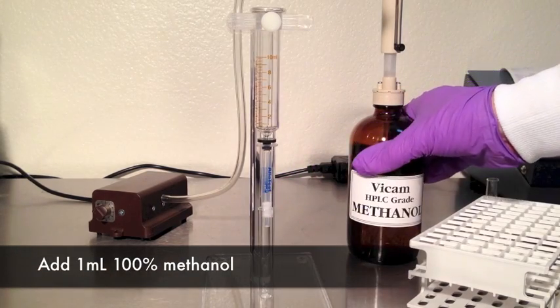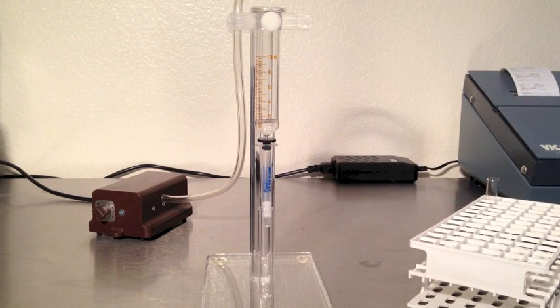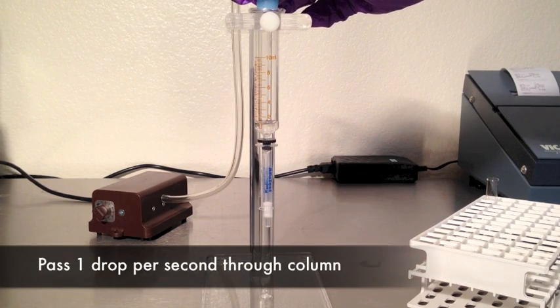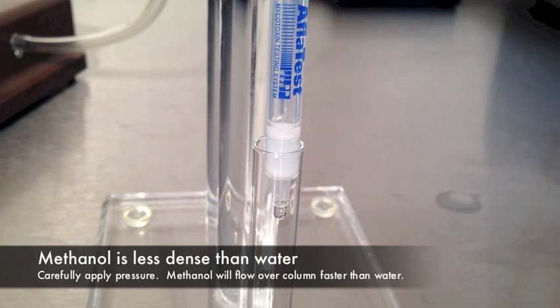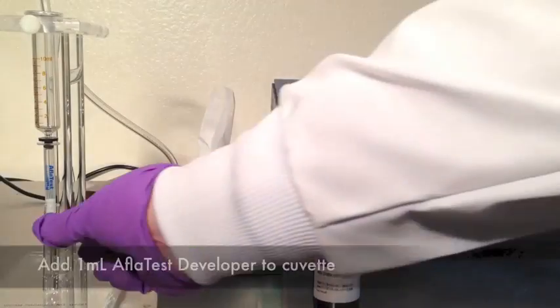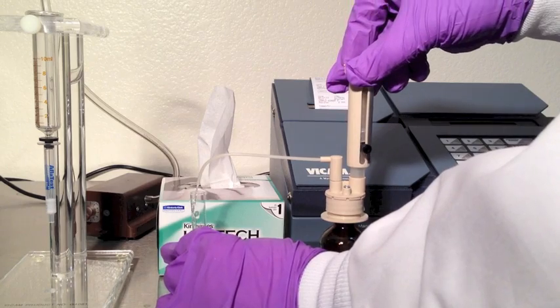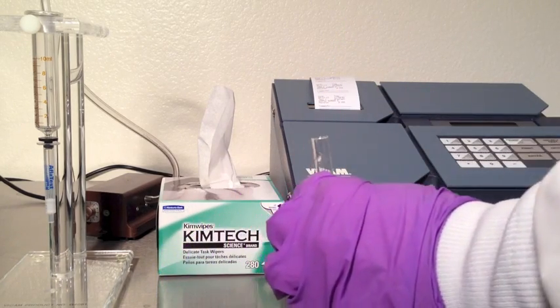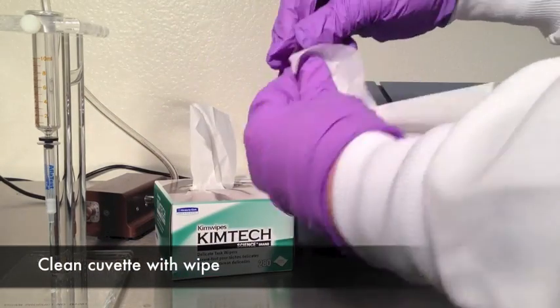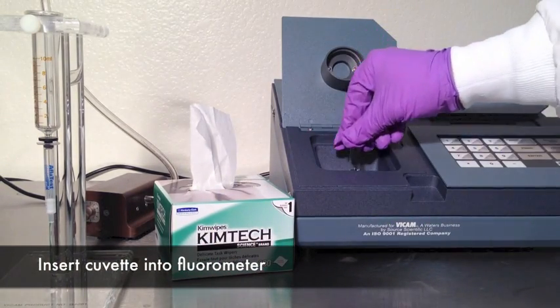Remove the waste collection cup. Place a glass cuvette under the column. Add 1 milliliter of 100% methanol to the syringe. Apply air pressure to the syringe and pass methanol very carefully at 1 drop per second — methanol is less dense than water, so use care as methanol will pass through the column faster than water. Remove the cuvette. Add 1 milliliter of AFLATEST developer and mix well. Clean the cuvette with a wipe, then insert into the fluorometer. In 60 seconds the display will show results and print a record of the test.